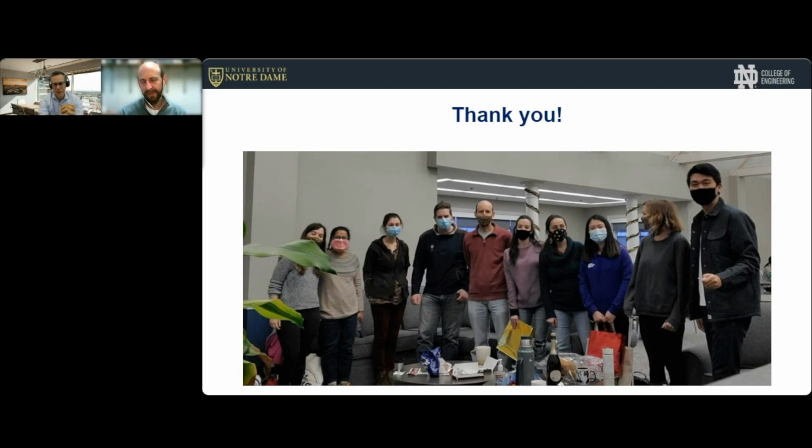So we have several webinars on OCT technology already available. And during one or two of these webinars, we talk about autocorrelation, which actually happens if the features within the sample interfere with each other. So normally in OCT, we have both arms of the interferometer, the reference arm and the sample arm, interfere with each other. But if structures from within the sample interfere with each other, then this suddenly pops up at the very top of the OCT image. So when you go down with your focal plane, you will see that several structures will appear or disappear right at the top of your OCT image. And once that happens, you know that these features are in focus. If you're interested, please drop a line at oct@thorlabs.com and we can discuss this in more detail.